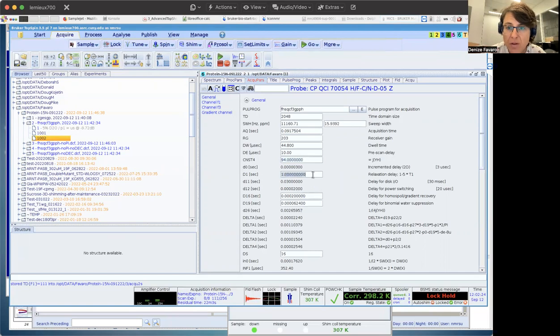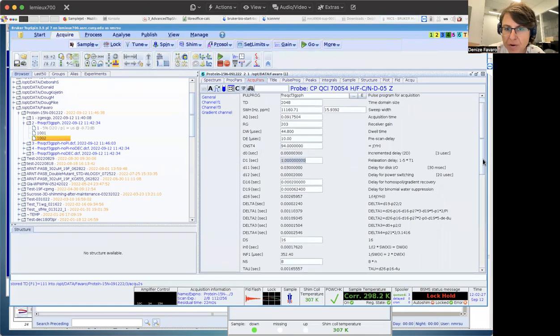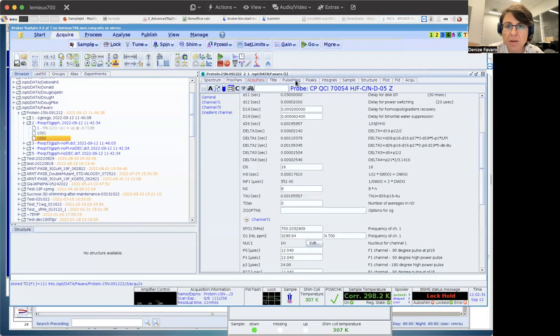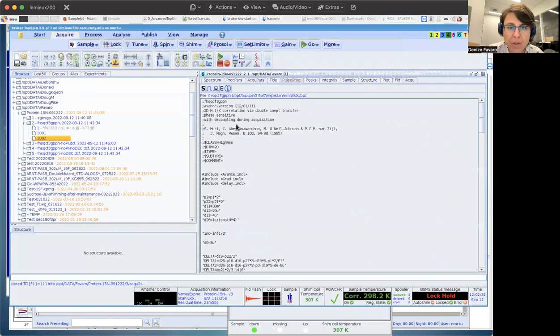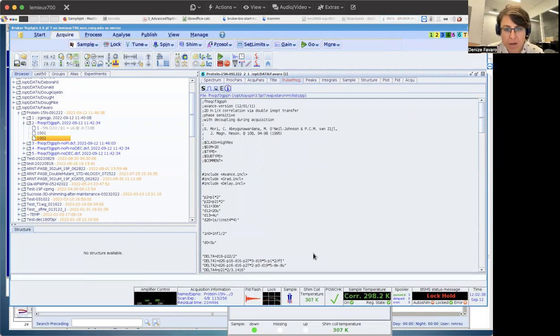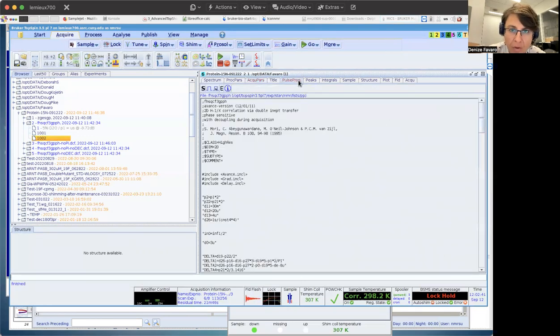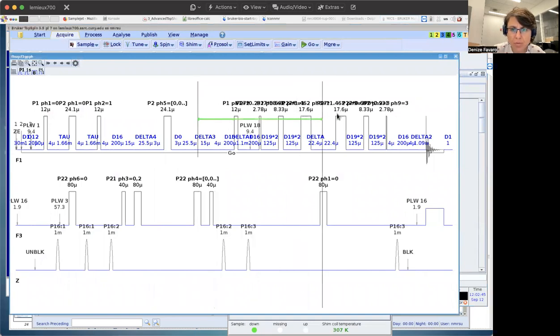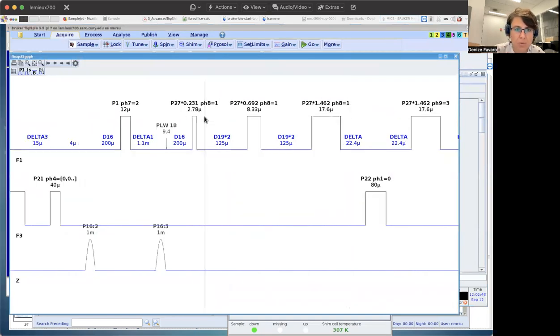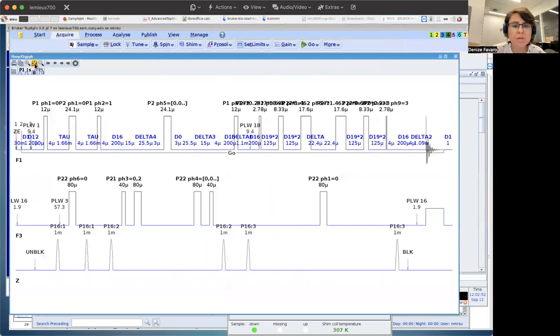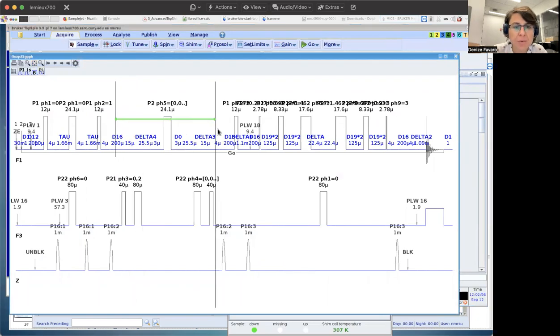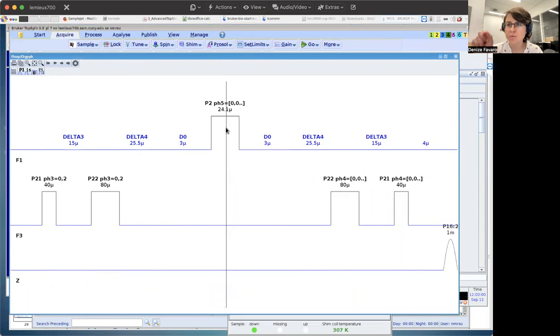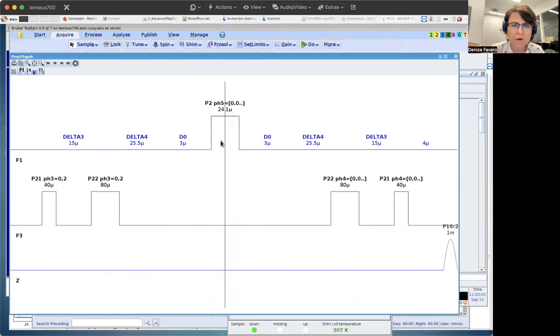Another thing is your D1. 1.5 is fine. For this, it uses a 3-9-19 scheme for water suppression. One thing that I also want to share is what happens if I remove the pi pulse in the middle of the evolution of the indirect dimension. What is the function of this pi pulse?